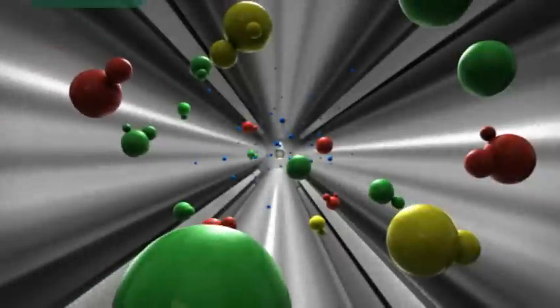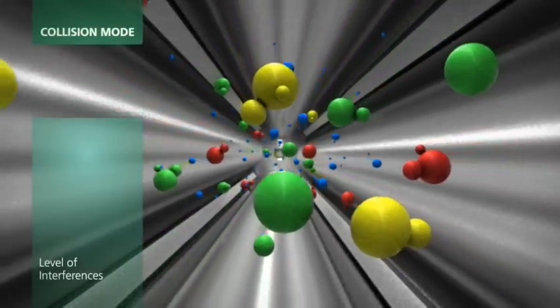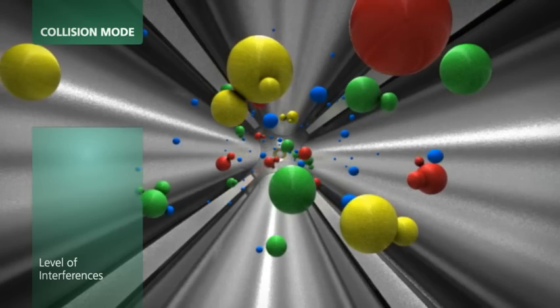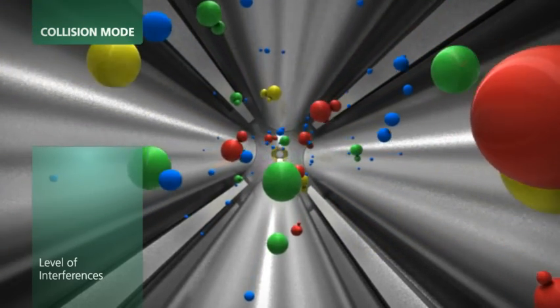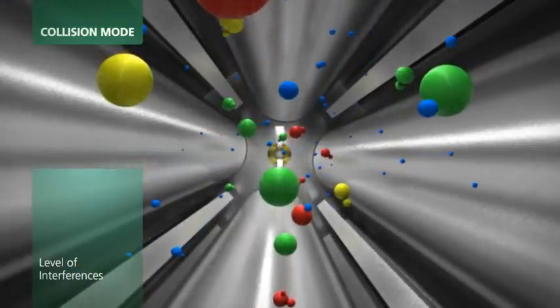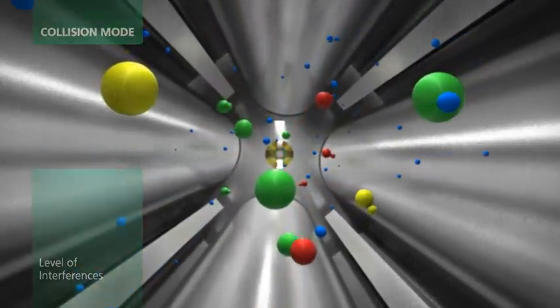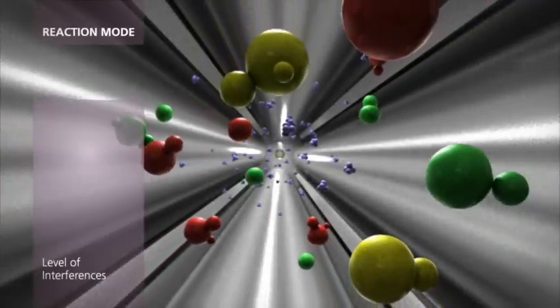Collision mode sees the introduction of a non-reactive gas into the cell that separates the smaller analyte ions from the larger interfering polyatomic ions. Collision mode is a very simple, effective way of improving detection limits in samples with low to moderate levels of interferences. When the level of interferences is high, dynamic reaction mode provides the best detection limits.